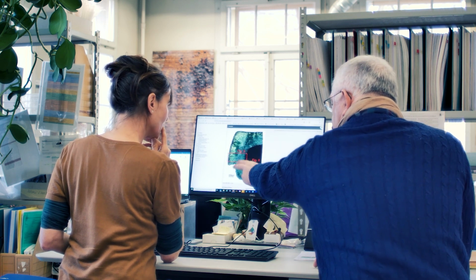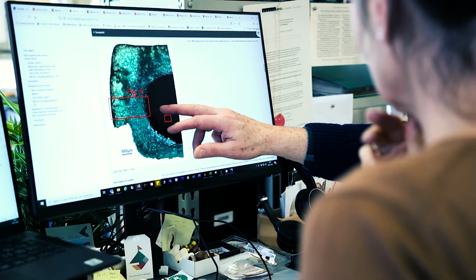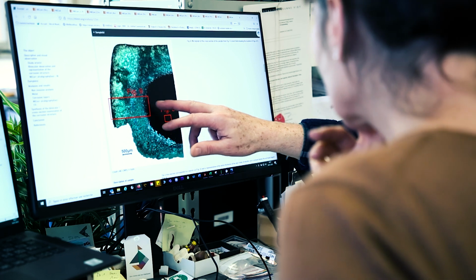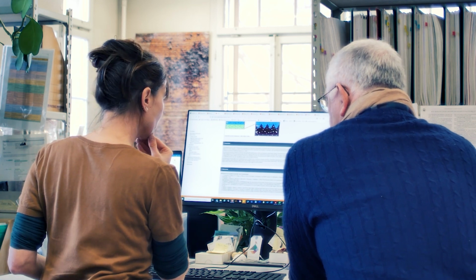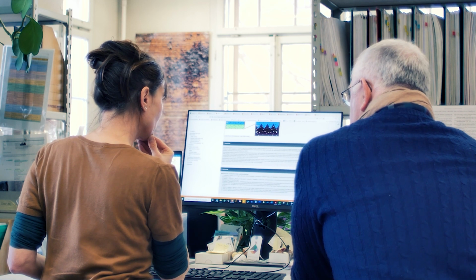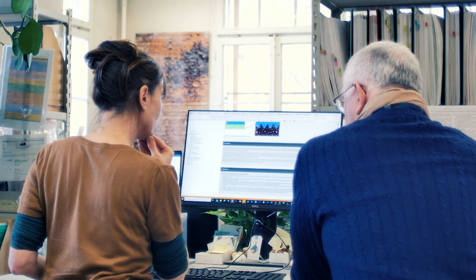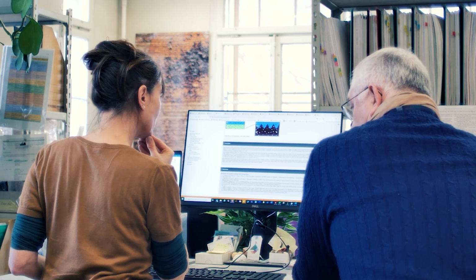So here you have an idea of the stratigraphy, you have the cracks here that you observed, but it seems that it doesn't go to the metal surface. Here you have the conclusion, and it says that you have stratigraphy, but even if the phenomenon is well described, there is no reason why, in fact, this alteration developed.